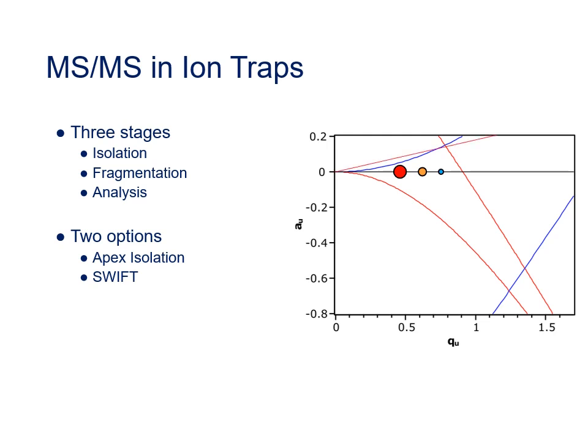Then the ion trap will set the RF and DC voltages such that the ion that you're interested in stays in the tip of the stability diagram, while the other ions in the trap are in unstable regions and are lost. Then, having isolated the ion of interest, the external voltages are removed and the ion can be brought back down onto the Q-axis. So now we've successfully isolated just the orange ion in this ion trap.